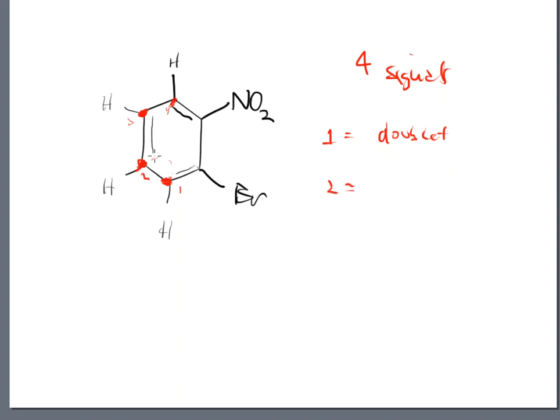And then here we have a different chemical shift. And then that chemical shift has 2 adjacent carbons, each one with a proton, doesn't it? Now, these are not equivalent protons, right? So that means we got 1 hydrogen here. So that's a 1 plus 1, which is going to be a 2. And then if I go right-handed side, that is another carbon with 1 hydrogen, and we add 1 onto that one, and that is a total of 2.